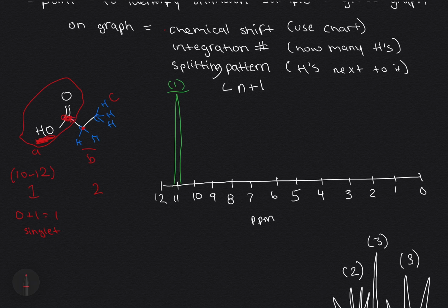The main thing we're looking at is the carbonyl group. So if you find on your chart 2 hydrogens next to this carbonyl group, you may have a chart that has it next to a carboxylic acid group, but your chart may only have hydrogens next to a carbonyl group. So then you just use that one, and that chemical shift should be around 2 to 3.